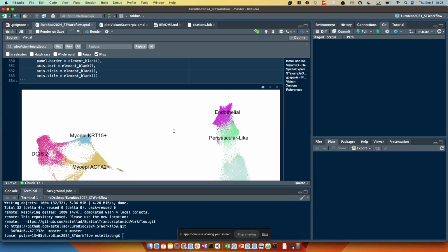Definitely. There are so many different packages to read about. For example, there should be one chapter of this book to suggest that if you only want to load single cell level, go with SpatialExperimentIO, or if you want more molecular based, then go with ME. It's not saying that one should incorporate the other; they should stand alone, and then we point to different groups based on their interest.